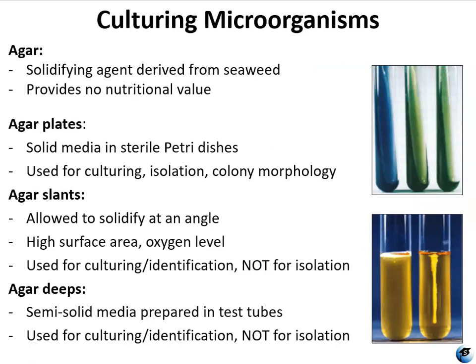Next you have agar. Agar comes in different forms, but the word itself, agar, comes from an agent that's found in seaweed, and it doesn't provide any nutrients, but what it does is it solidifies the media. So you can literally have a broth, a mixture of nutrients and chemicals in broth form, and then you add agar to that, and the agar just solidifies it. So anytime you see agar, whether it's an agar plate or an agar slant or agar deep, you know that is a solid media because it has this solidifying agent called agar in it.